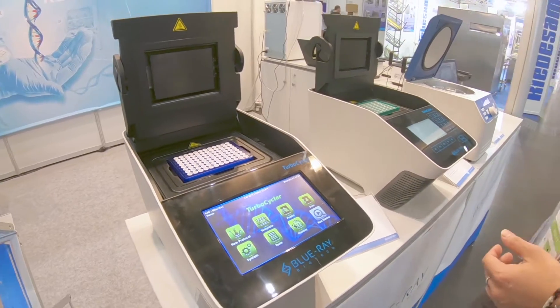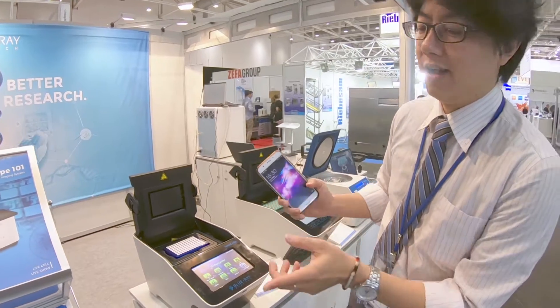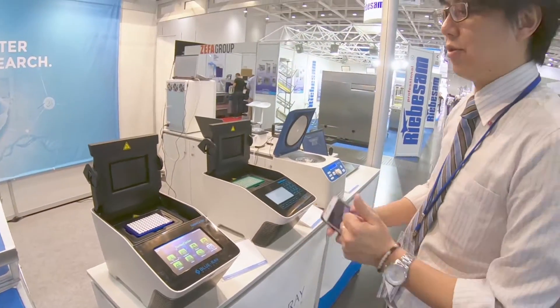Most importantly, it is equipped with Wi-Fi function, so you can connect to your mobile phone and check the running status at any time. You don't need to check on site all the time. It's really convenient.